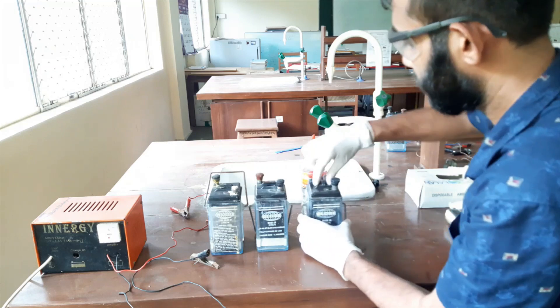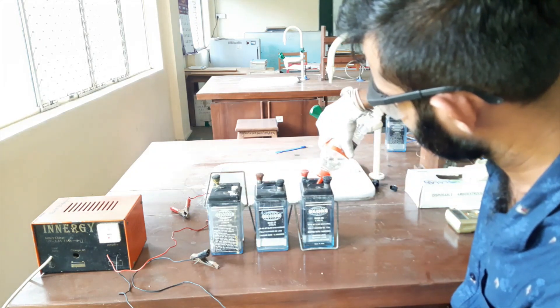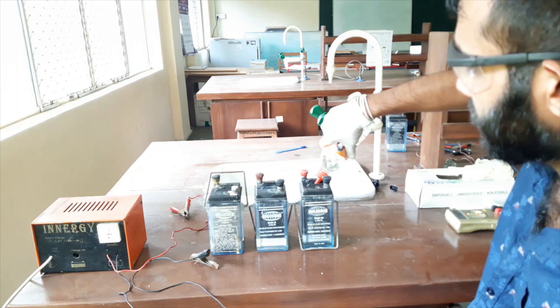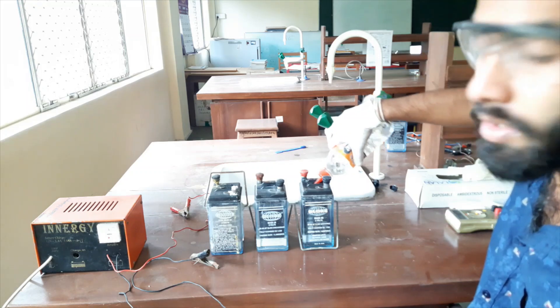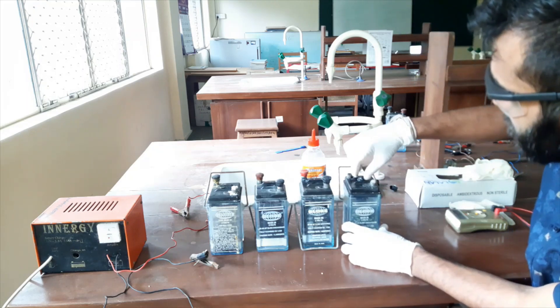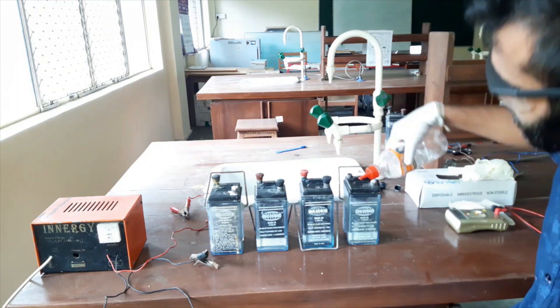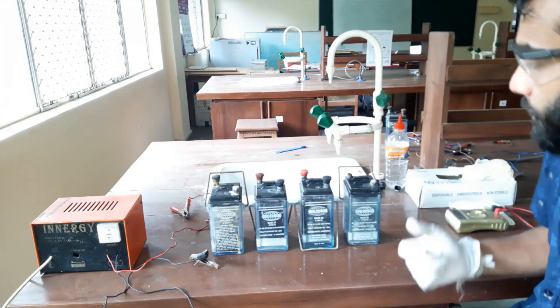Next battery. Normally, if you are a university student or research student, the technical officers will do this charging process — you do not have to charge your battery yourself — but it is better to know the method. I will get another lead accumulator. All are up to the mark; every cell contains sulphuric acid up to its mark.